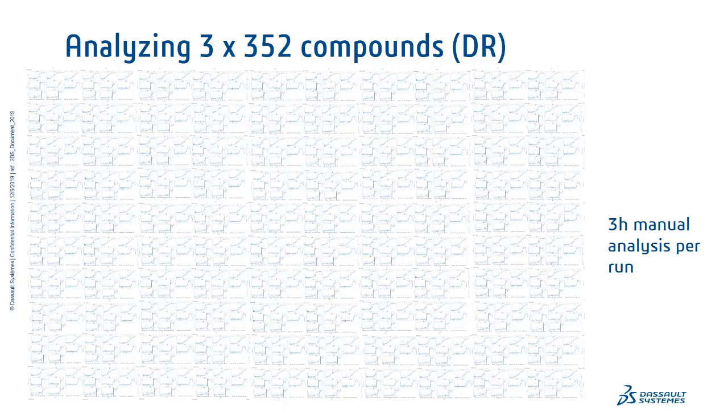But at the 2 steps that Guillaume mentioned, the human intervention is somehow crucial, or at least we need to have a quality control. The first one, assessing the quality of the control wells, was okay because it was quite simple.